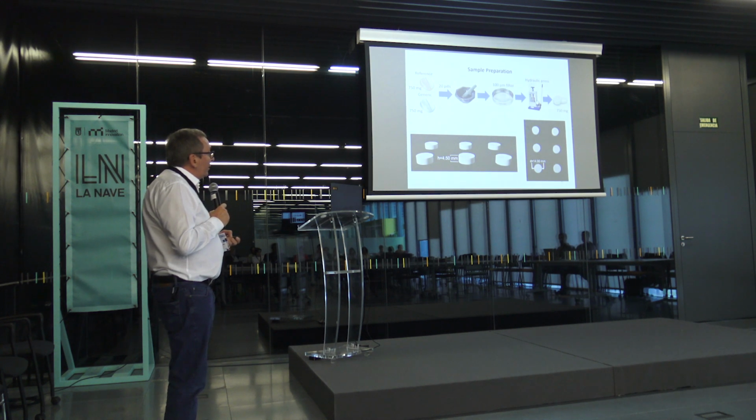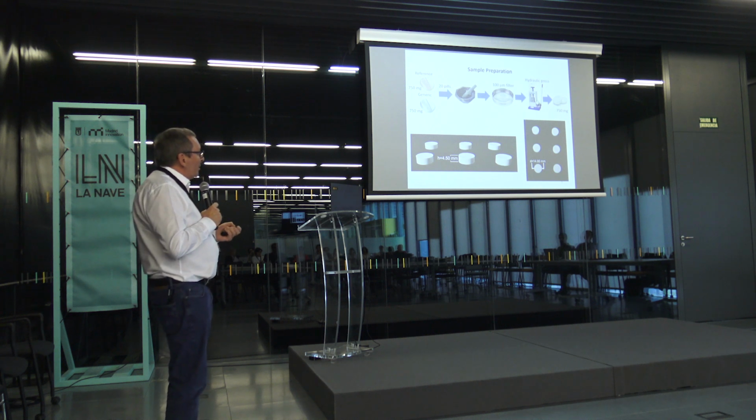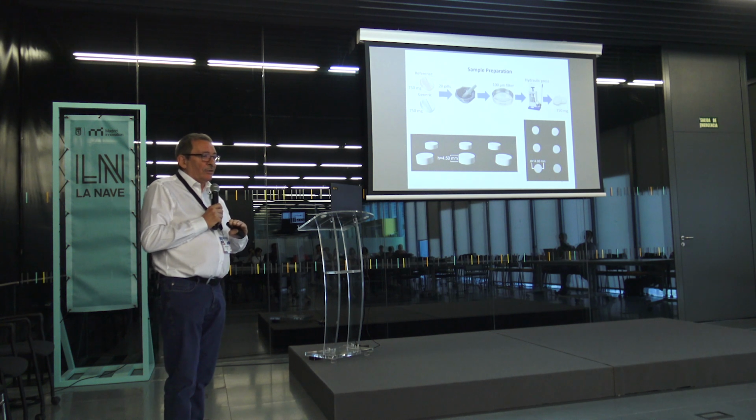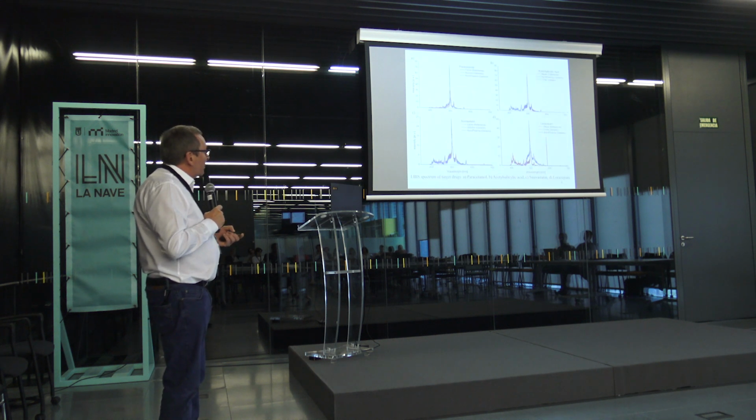The sample preparation is a little special because we use 20 pills to obtain the powder, then filter it with a 100 micrometer filter, and then use a press to obtain the pills again. This process is needed because all drugs contain a film over the surface, so we obtain homogeneous samples.